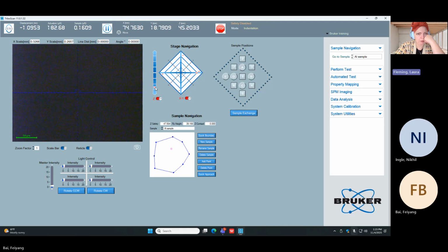Hope you went right through the focal point. Stop. Stop. Sorry. You went much further down. It was further up. Yeah, that's what my specs say. Oh, yeah, I just didn't want us to crash the optics. Sorry, we were getting pretty low. Yeah, I was looking at it.